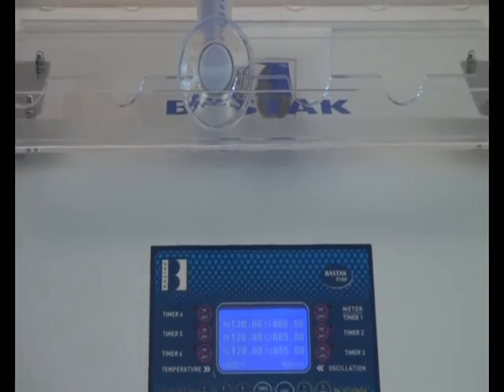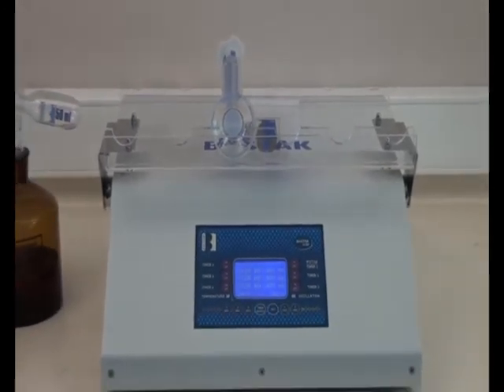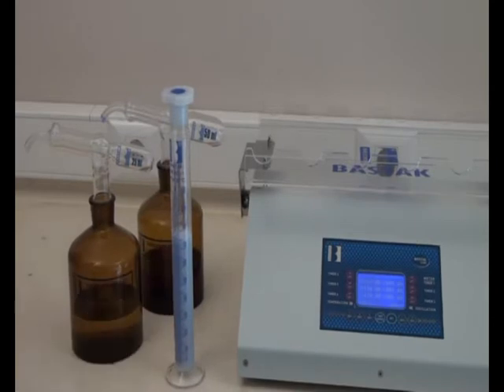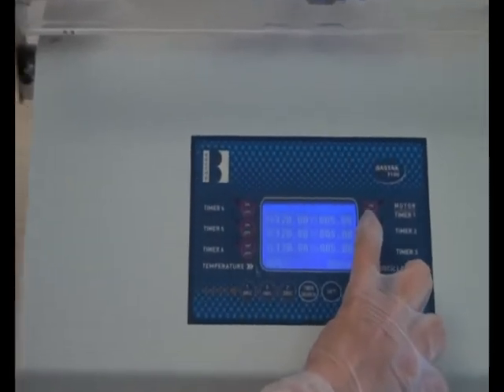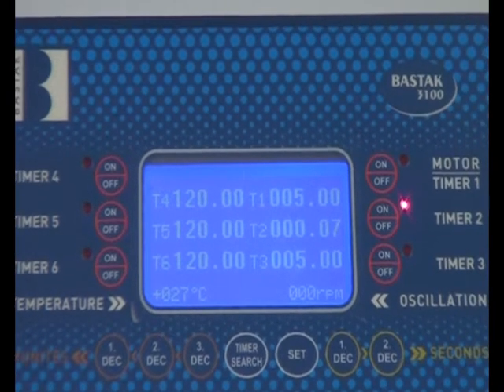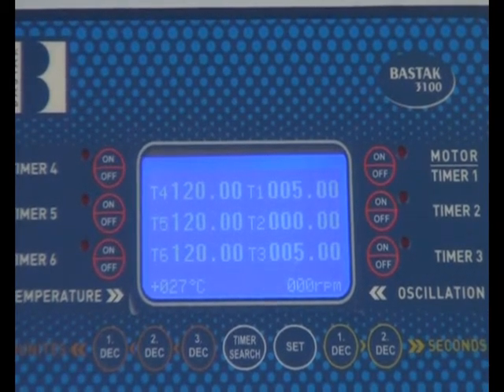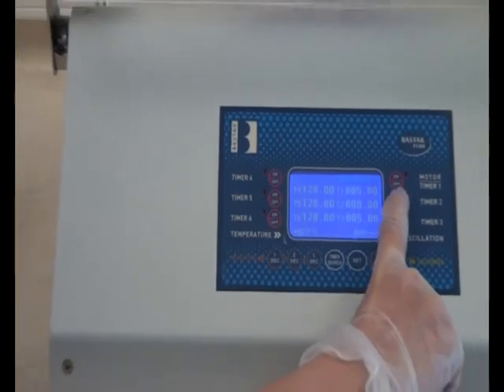The off button is pushed at the end of the shaking process. Then the test tube is taken off from the platform and put onto flat ground. The on button is pushed to start 5 minutes of waiting process. After the warning signal at the end of 5 minutes, the off button is pushed.